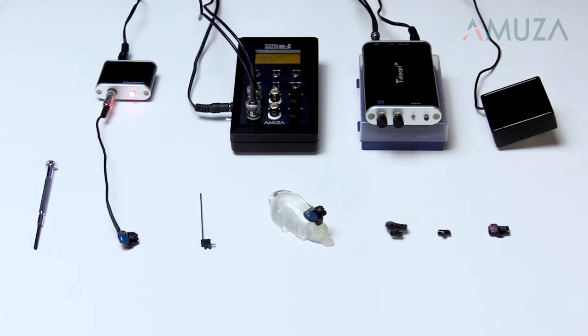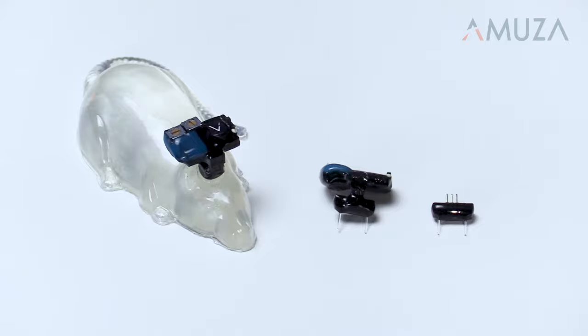The implants are made to order with many options for light colors, single or bilateral fibers, and fiber diameter. Two-color implants are available for bistable options or stimulation and inhibition at the same site.